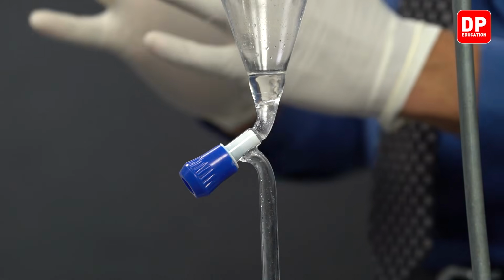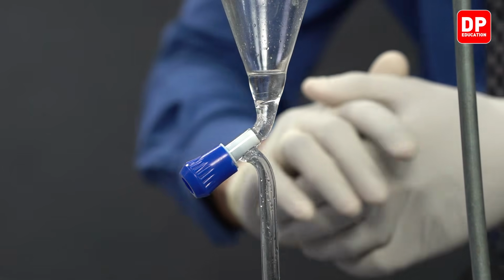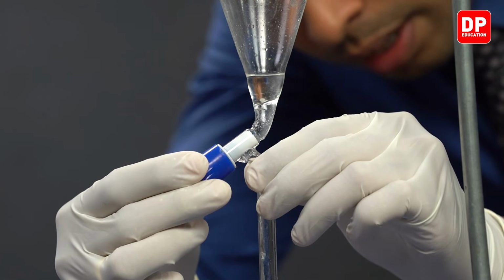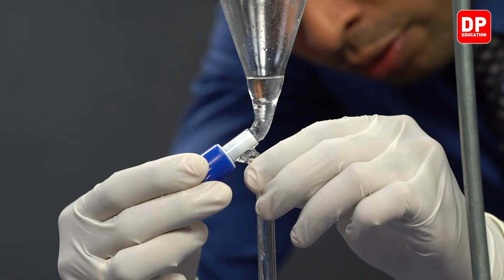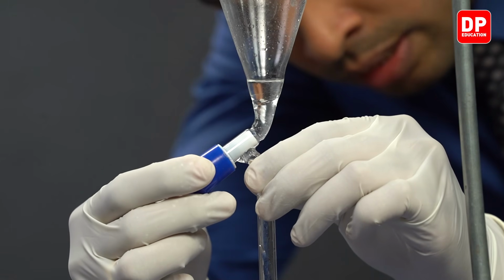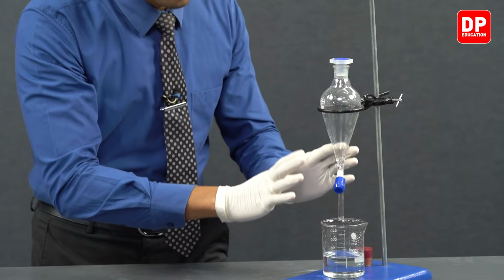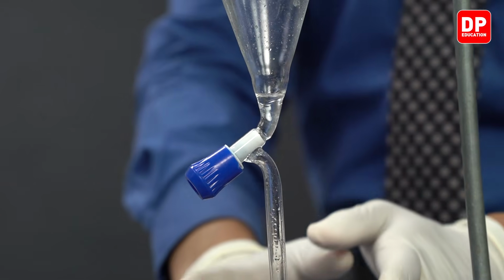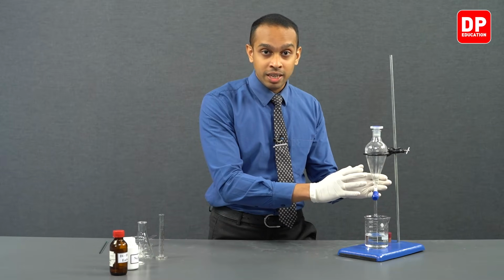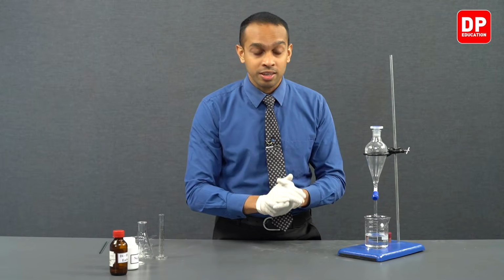Now we will very carefully separate out the two layers by turning this stopcock and allowing only the water layer to run down. And as soon as we have removed all of the water, now students, we have stopped collecting the aqueous layer into this beaker, because what is remaining in the separating funnel is now just our diethyl ether layer.